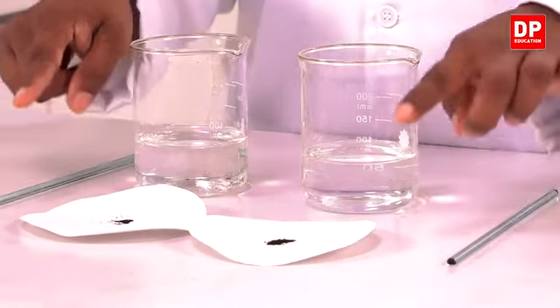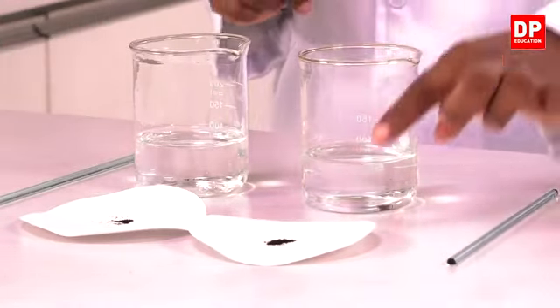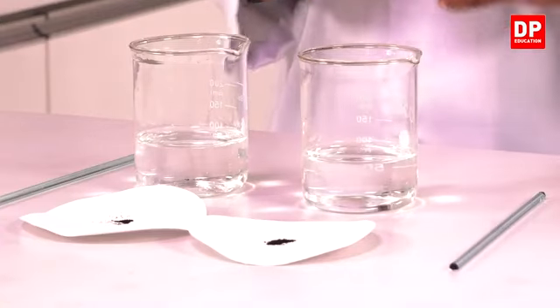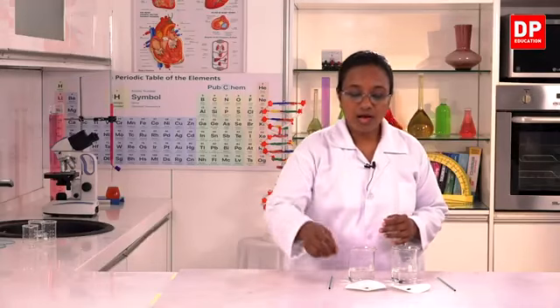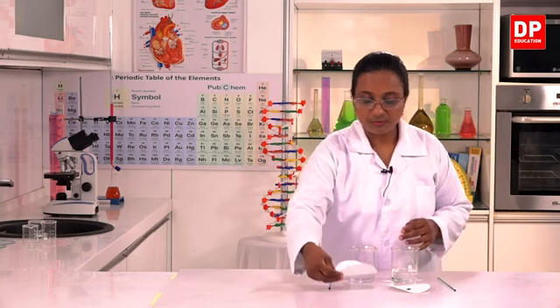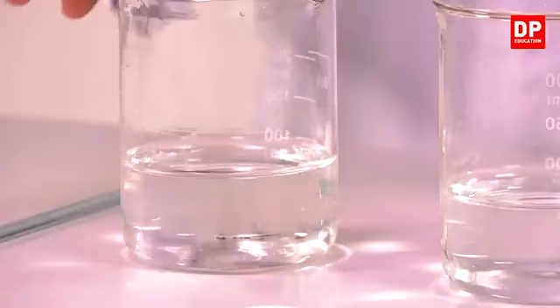And here again, I have a very small amount of potassium permanganate and a larger amount of potassium permanganate. So, the same solute but different amount. Now, I will dissolve the smaller amount of potassium permanganate in water.